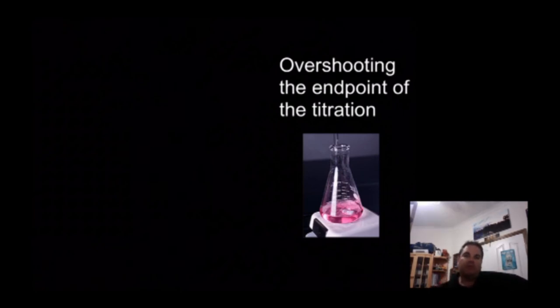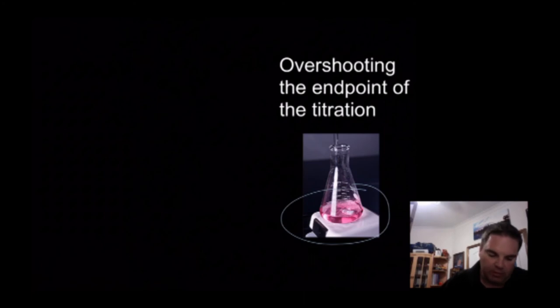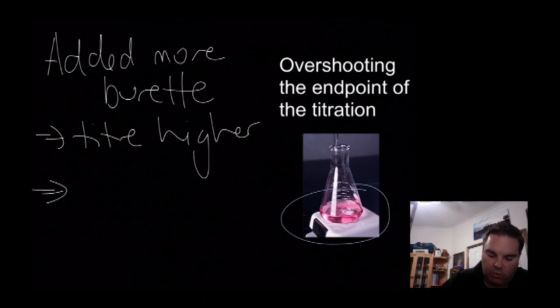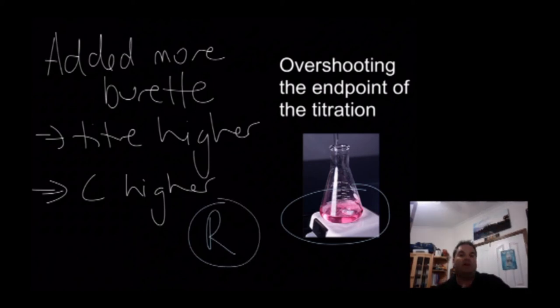Overshooting the end point of the titration. The colour shown is probably a little bit darker pink than what we'd actually like. In titrations you always want to aim for the first permanent colour change - normally a pale pink. If you've gone a little bit further in your colour change, that means you've added more from your burette, making your titration value appear higher. That makes your calculated concentration of the sample in the conical flask appear higher as well, because it suggests more moles were needed to reach the end point. This is another example of a random error - overshooting affects your ability to get concordant titers, which is your precision.